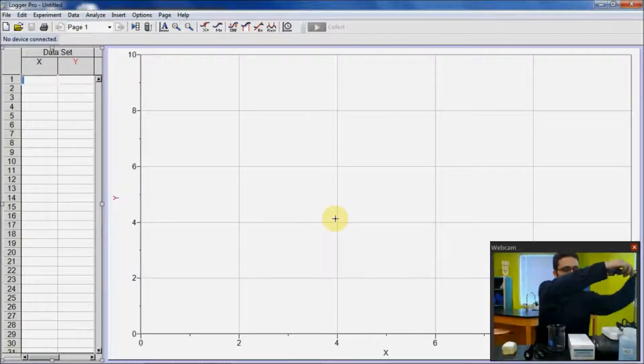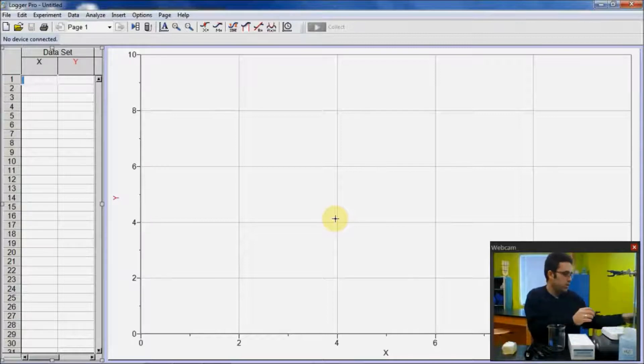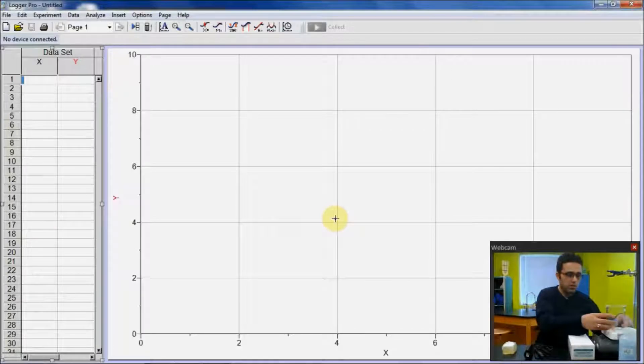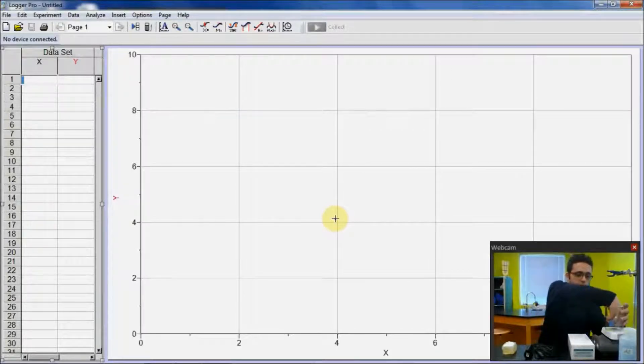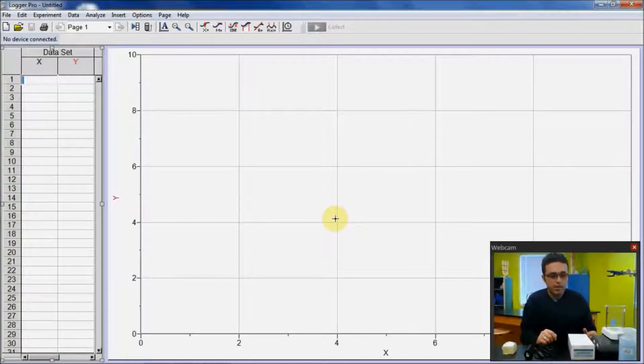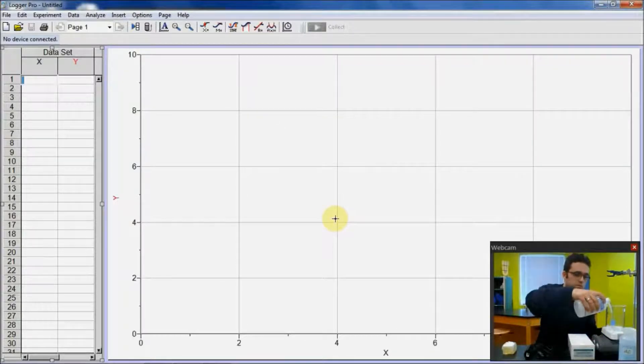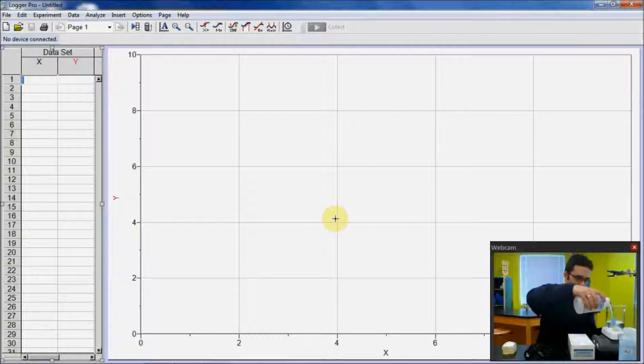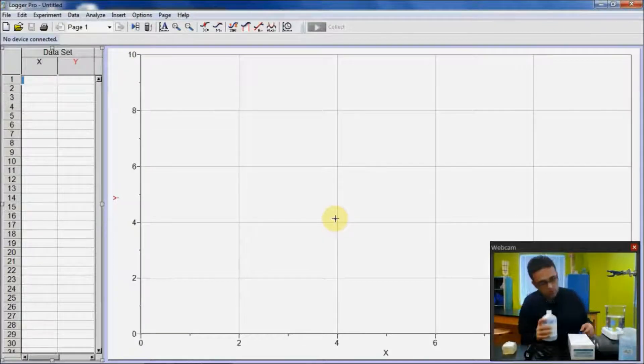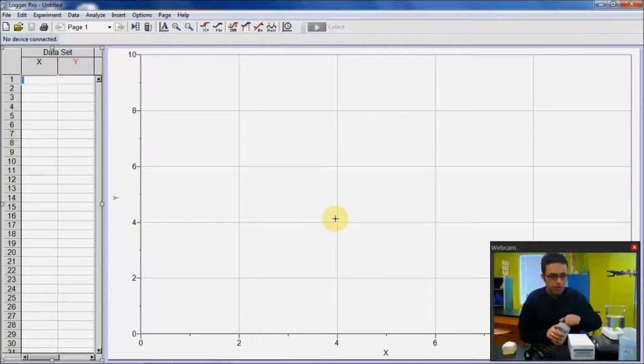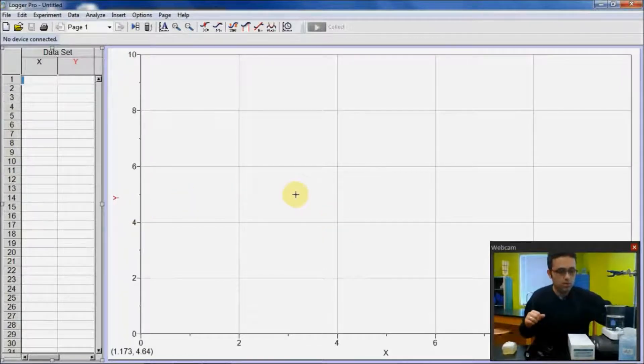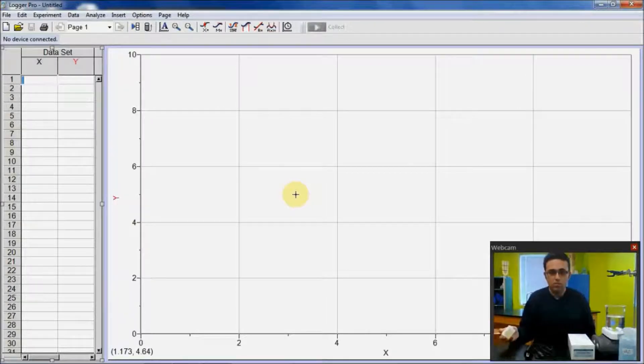First, I will plug the magnetic stirrer into the outlet. And then I'm going to place my beaker on the magnetic stirrer. I will place the magnet in the beaker. And then I'm going to put distilled water in the beaker. I think this is enough. You don't really care about how much distilled water you have put in the beaker, but just to cover the model cell is enough.